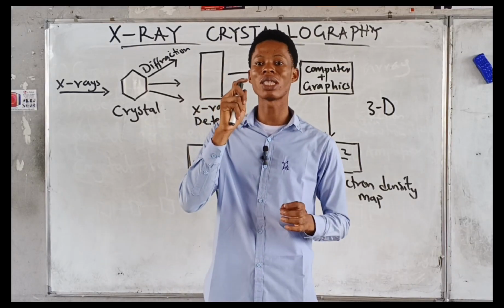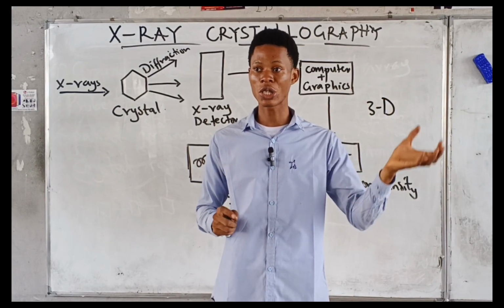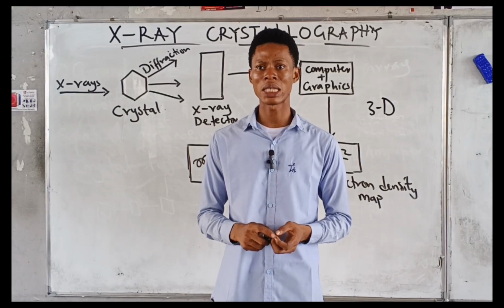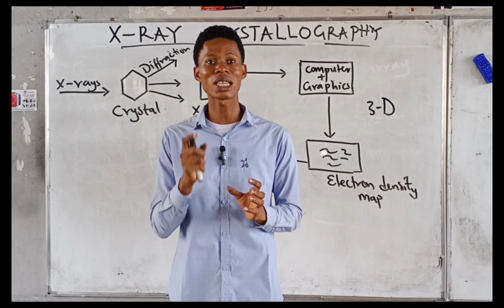Any substance you want to determine the three-dimensional structure of, that substance must be what? A crystal, right? You cannot use it for liquid. Cannot use it for gases. Any stuff you're using must be a what? A crystal. A crystalline substance.